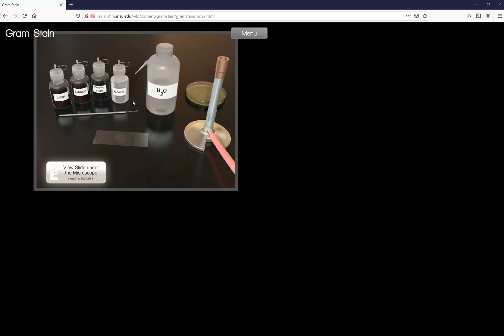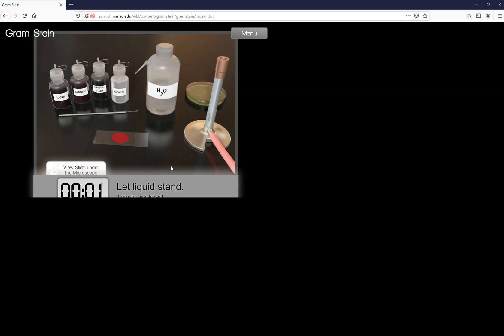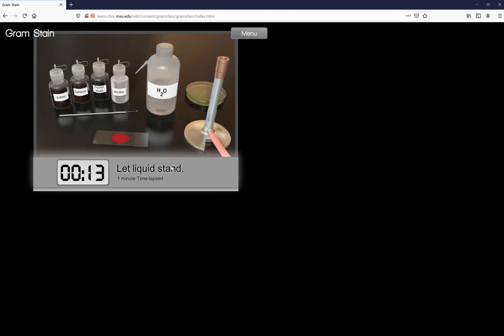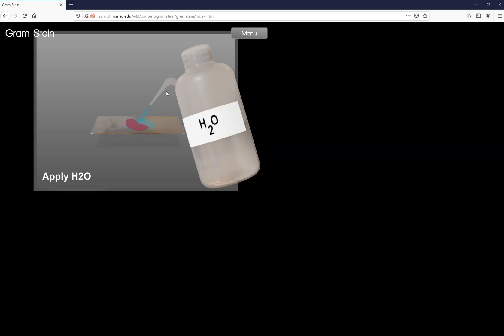So let's add our second or counter stain called safranin and that will color the gram negative cells a pinkish red. That will also put it in the gram positive but you won't see it underneath the dark purple of the crystal violet. Go ahead and rinse when your time is up.